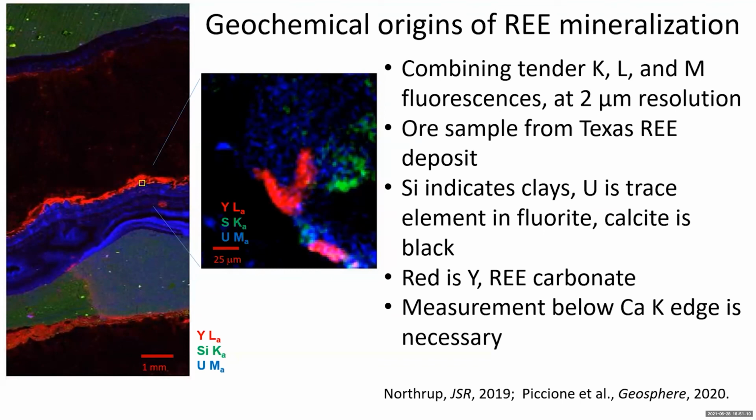This study was made possible at this resolution because we're operating below the calcium K edge. So we're not seeing the extremely high calcium signal.